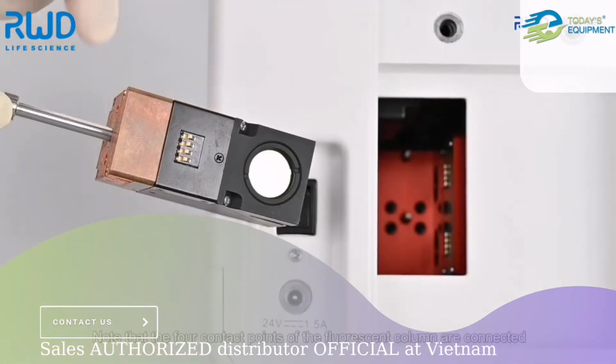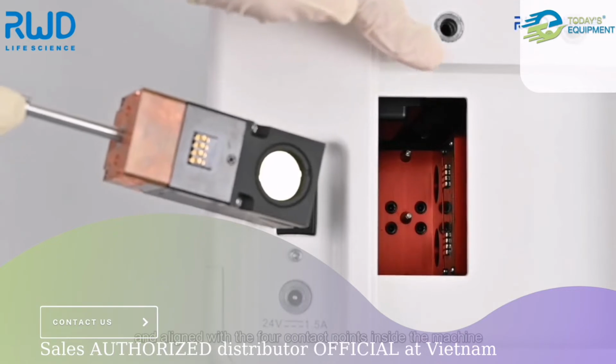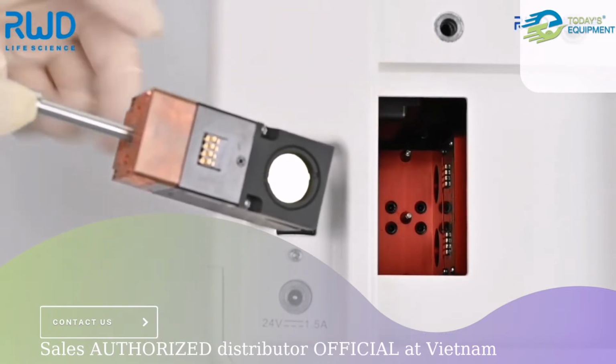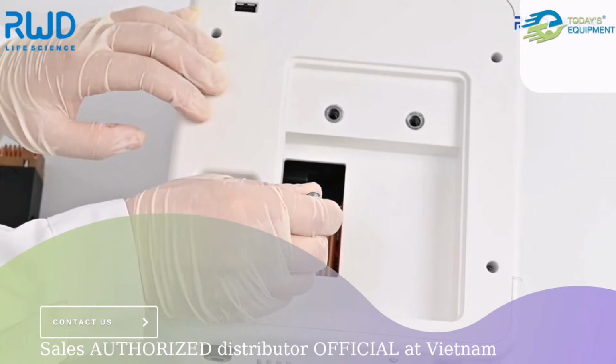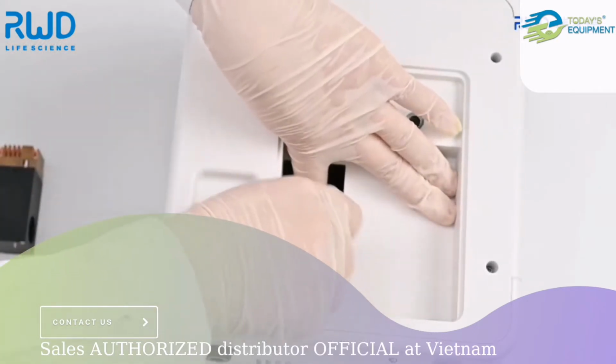Note that the 4 contact points of the fluorescent column must be aligned with the 4 contact points inside the machine. Along the direction of the limited post, slowly tighten the 2 screws on both sides.